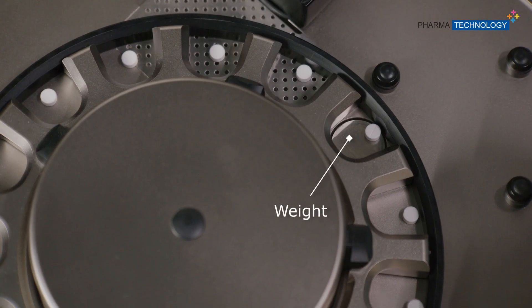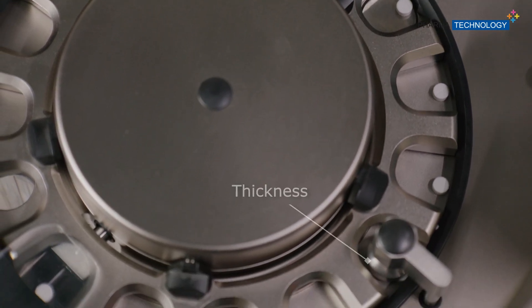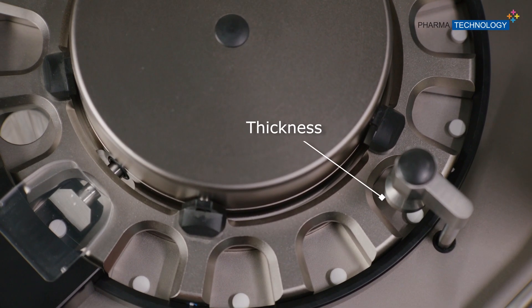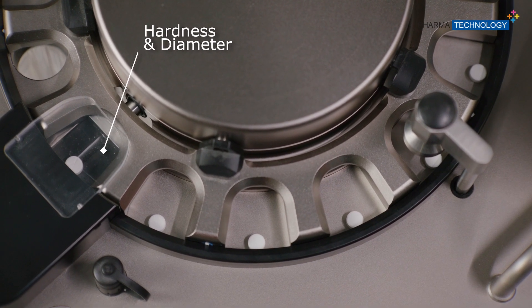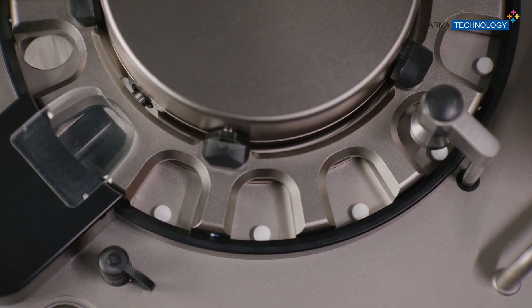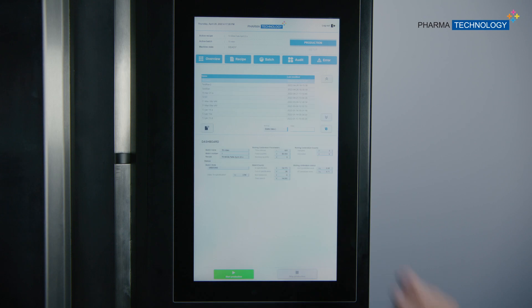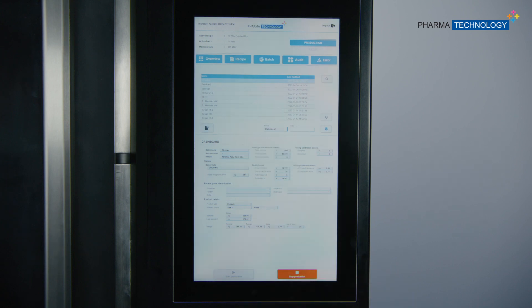When dealing with tablets, an optional 4-parameters tester can be embedded to measure sample weight, thickness, length or diameter, and hardness. All these sample measurements can be used for conventional in-process control purposes. While using the machine, the intuitive software guides you throughout the various steps, from the recipe setup until the final reporting.